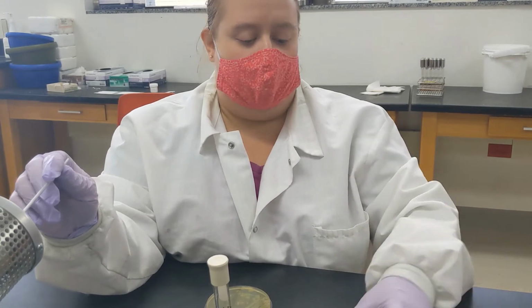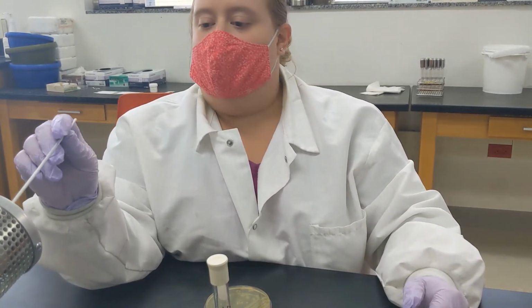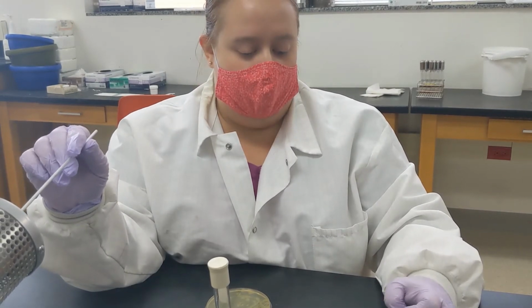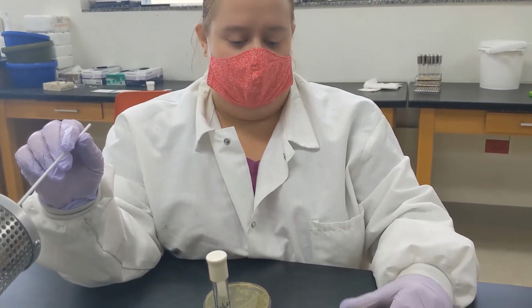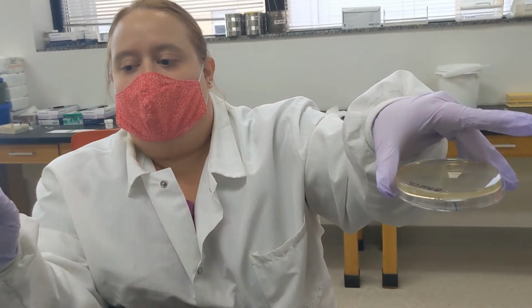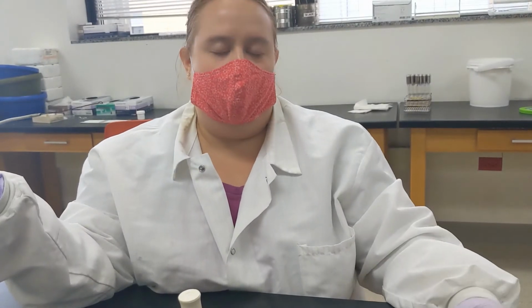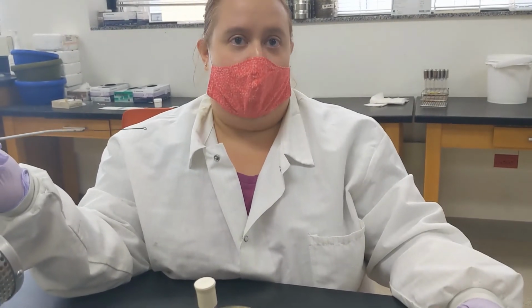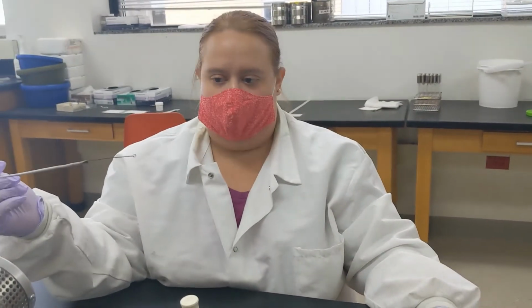The second thing we're going to look at is the ability of your organism to break down starch. So in this test, we have a plate that contains starch. The starch plate has one blue and one green streak on the side. And we are specifically looking for the presence of the enzyme amylase. Amylase is the enzyme that breaks down starch. Some bacteria have this enzyme, some bacteria do not.